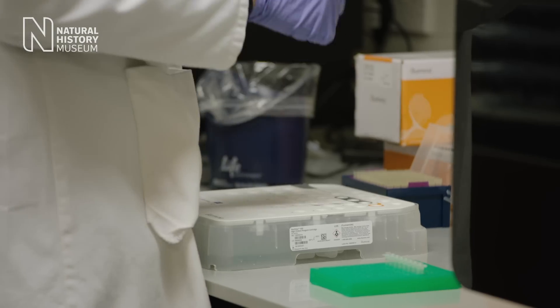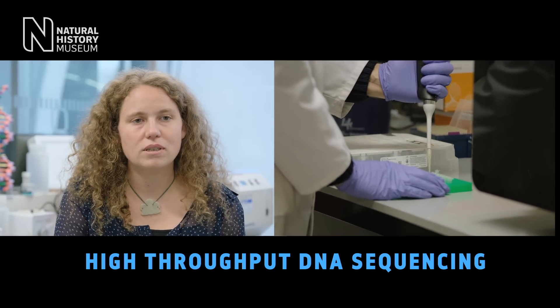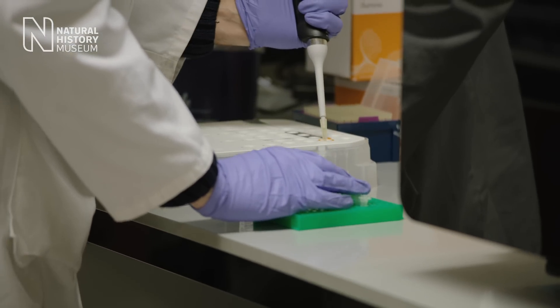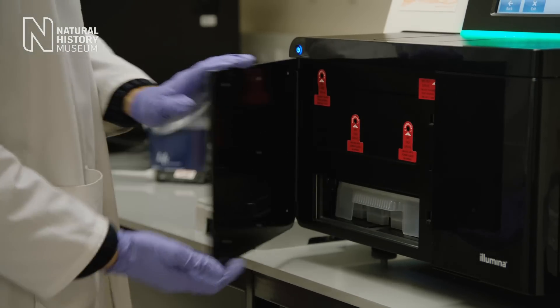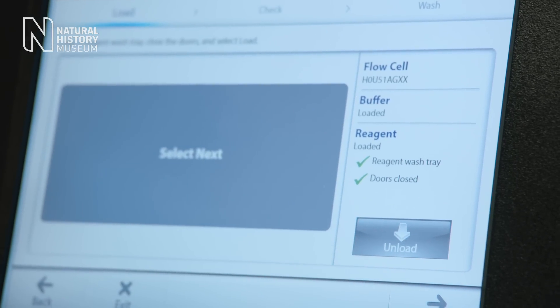Once we know that the PCR has worked, we send the samples for sequencing. We do high-throughput sequencing — it's a cutting-edge method, so we can sequence many samples at the same time. If the samples are good enough, they get transferred onto a chip, and that chip gets transferred into the sequencing machine. Once the machine has started, it takes roughly three days for the sequencing run to complete.